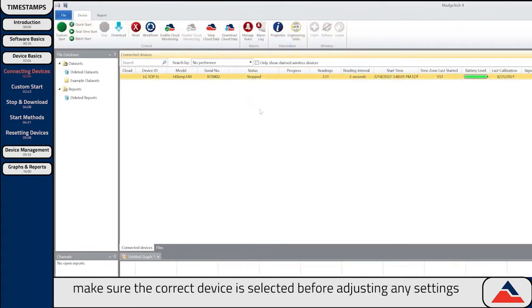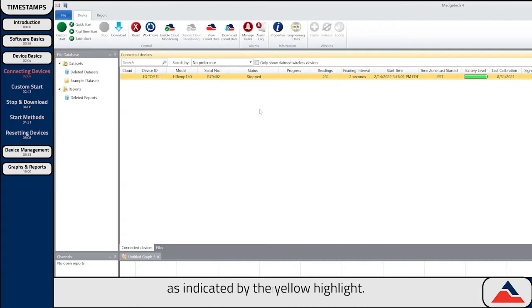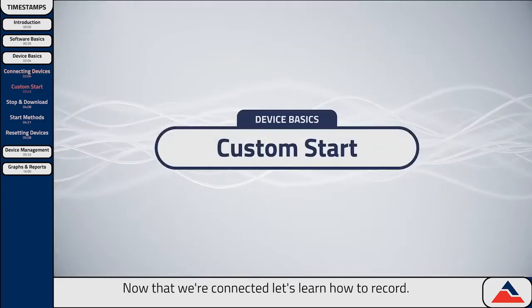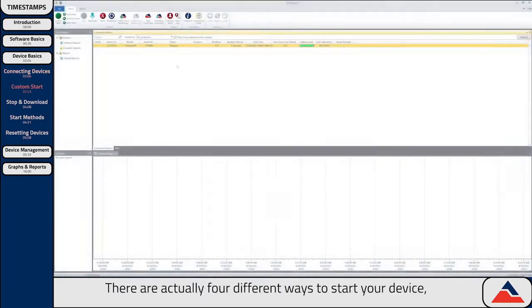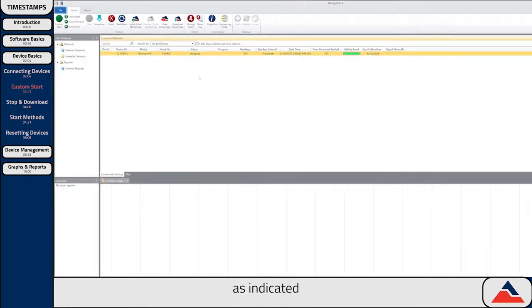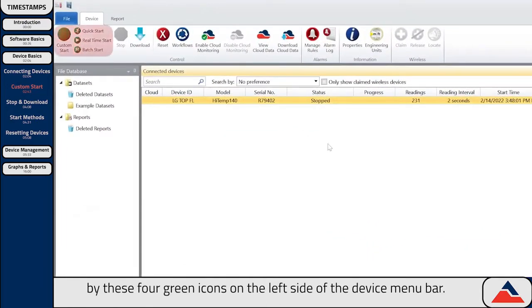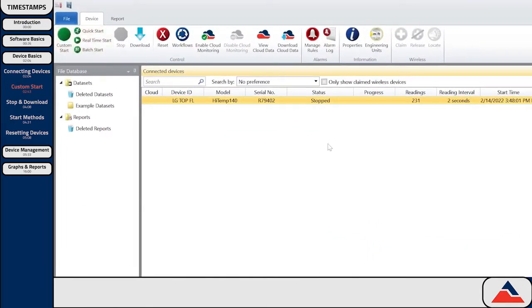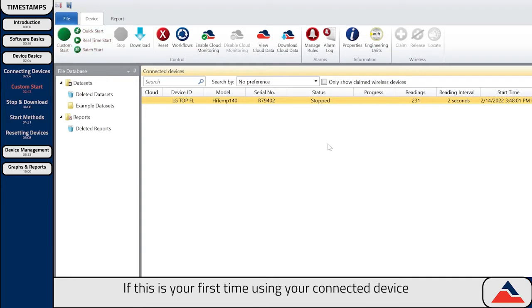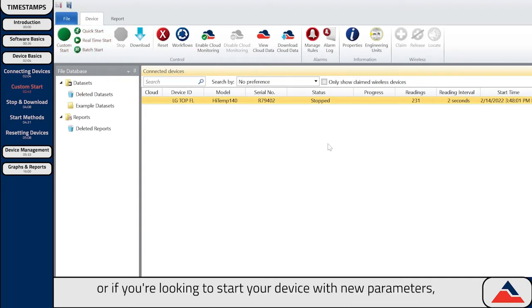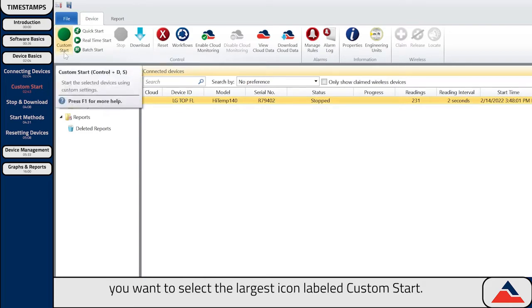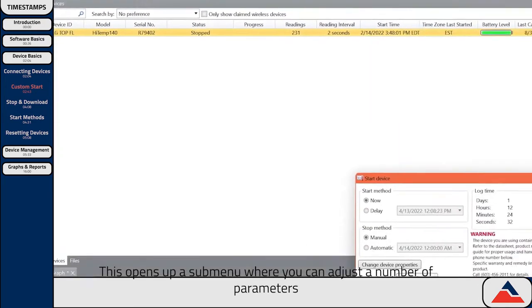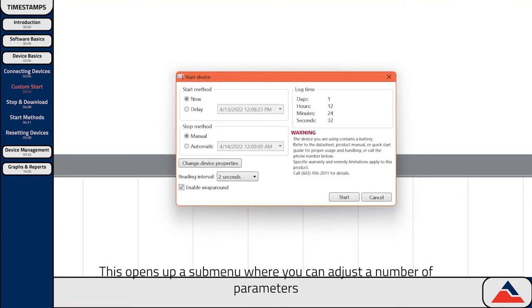If multiple devices are connected, make sure the correct device is selected before adjusting any settings, as indicated by the yellow highlight. Now that we're connected, let's learn how to record. There are actually four different ways to start your device, as indicated by these four green icons on the left side of the device menu bar. If this is your first time using your connected device, or if you're looking to start your device with new parameters, you'll want to select the largest icon labeled Custom Start. This opens up a submenu where you can adjust a number of parameters.